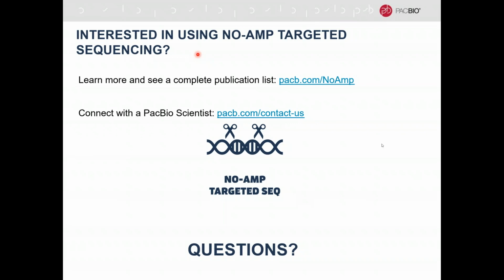Okay, so let's see. There's a quick question around costs compared to PCR. I think we may have answered that. In essence, if you're doing multiple alleles, multiple targets per sample, you're down around $20 to $40, including sequencing costs. So that's probably getting pretty close.